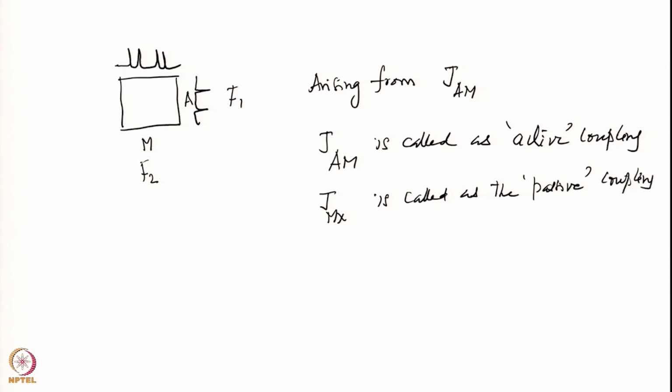Okay. So now if I want to write the splitting pattern of both the spins A and M, suppose I have this A chemical shift here and this splits because of the AM coupling, as in the case of double quantum filtered COSY or the COSY, and this produces inside there, because of the active coupling, plus and minus. So therefore inside here there will be pluses and minuses. This splitting will lead to plus and minus. And what about the M?